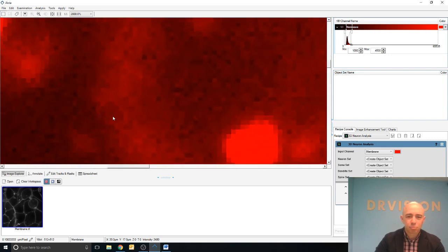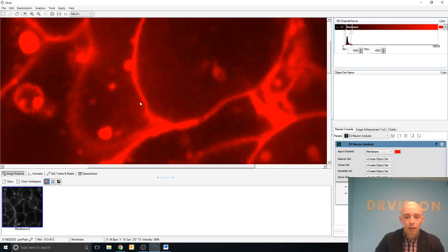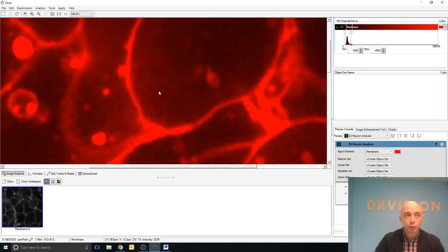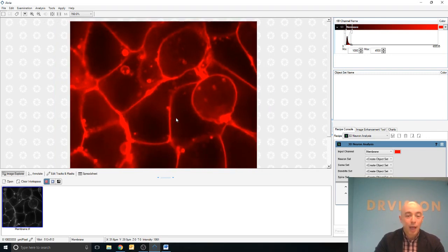Some of these pixels don't look exactly right, do they? That's what we call noise. Every image will have some noise, and here it looks like we have some low intensity background fluorescence causing a noise. A good image, however, will have a lot more useful data in the signal than noise, and this is often called signal to noise ratio, or SNR. A high SNR image typically makes a better looking image. They are easier to process and more reliable to analyze.